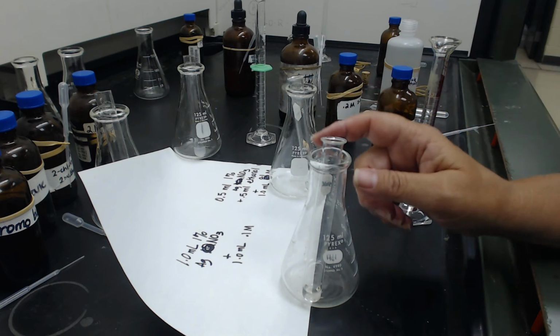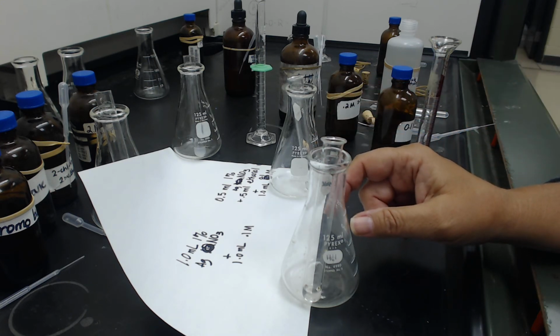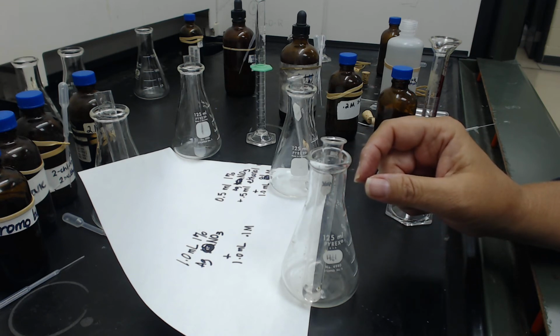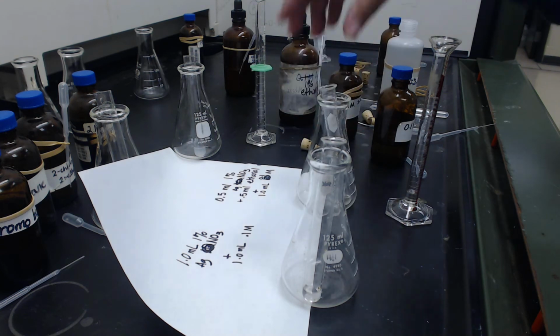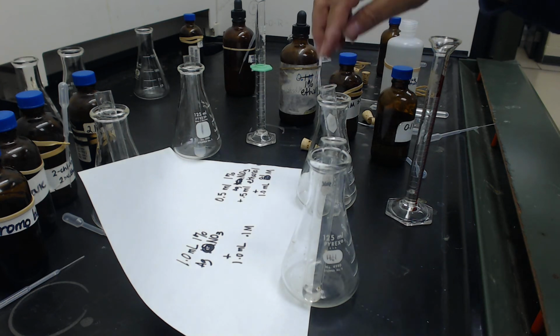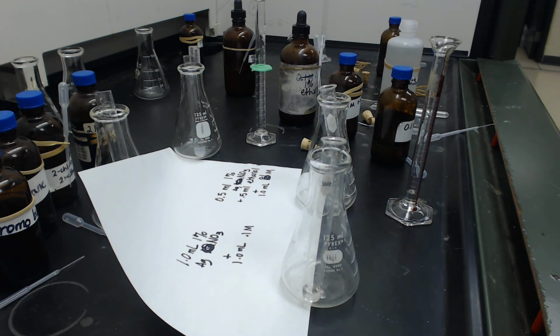So in my first test tube, I have 1 ml of silver nitrate in ethanol. And in my second test tube, I only put a half ml of the silver nitrate, and then I added a half ml of ethanol. So basically, the second one is half the concentration of the first one.